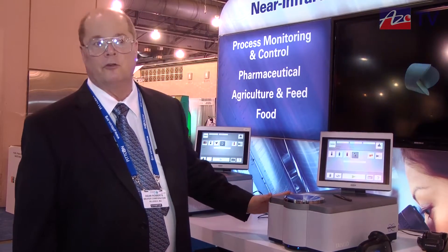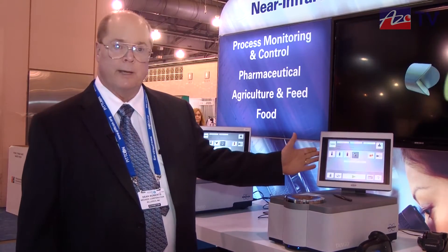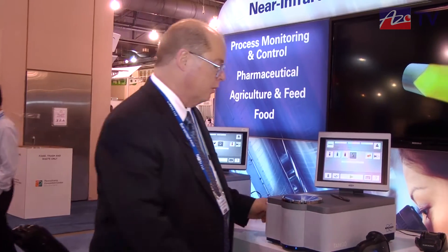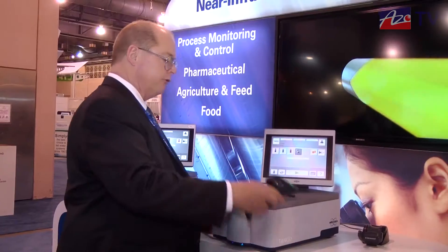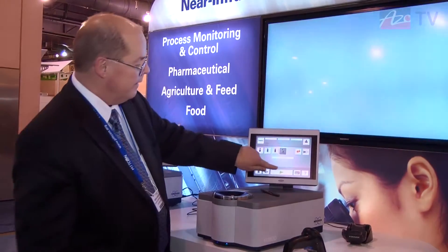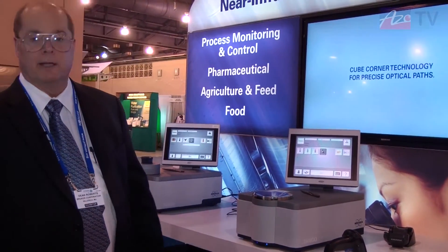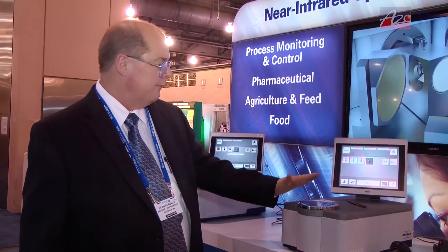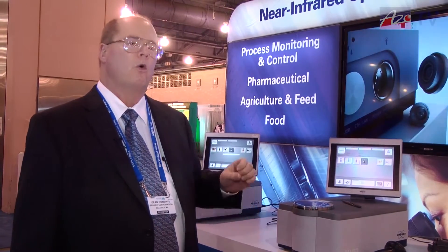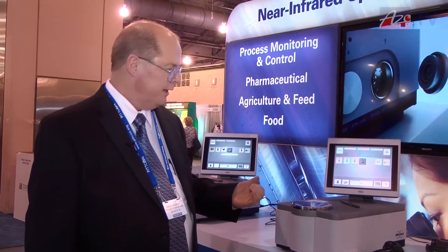The key features of this instrument include the embedded touch panel PC with a barcode reader, so that we can identify the sample by just reading the barcode and then pushing the go button to begin the analysis. The measurement is performed on the sample after the button is pressed, and then the appropriate values for the quantitative analysis will be reported after the measurement is finished.